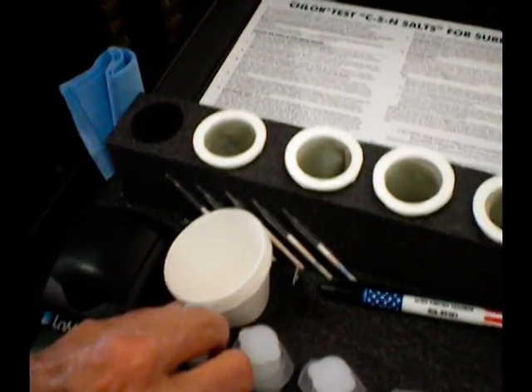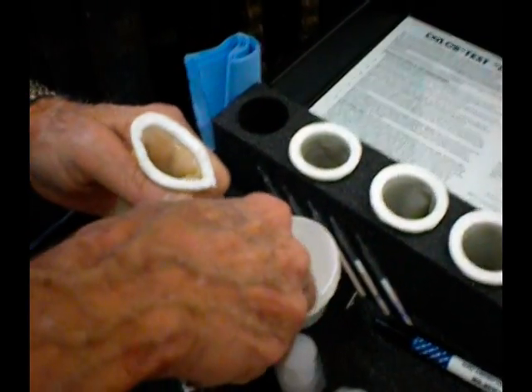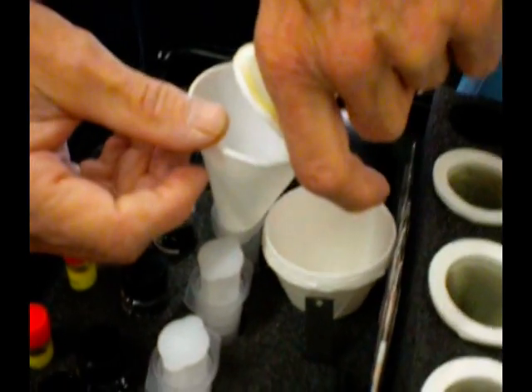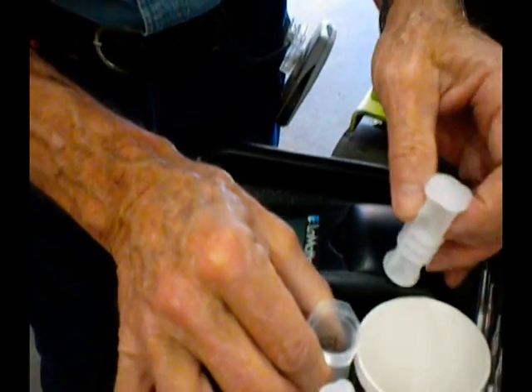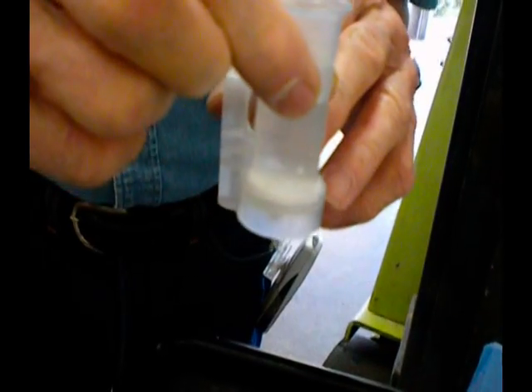After you remove the sleeve, we use the auto vial, which is the component that is a filter. Remove the top, place the funnel in, and pour the extract into the auto vial. These are all one-time use components — use them once and throw them away. The extract will not run through this filter by itself; it's a very fine filter and actually takes pressure to push it through. Put the plunger in and squirt it right back into the bottle that you removed it from.